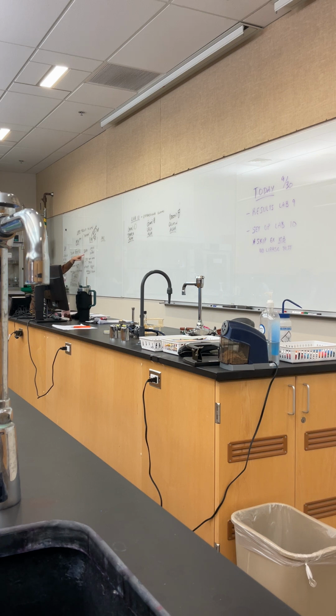So my sugar is going to be making it what? Is it a visual difference, or is it killing things? Is my sugar killing things? No, it's a visual difference, right? So does that mean it's selective or differential? Differential. If I'm not killing something, if I'm getting a visual difference, that's differential.